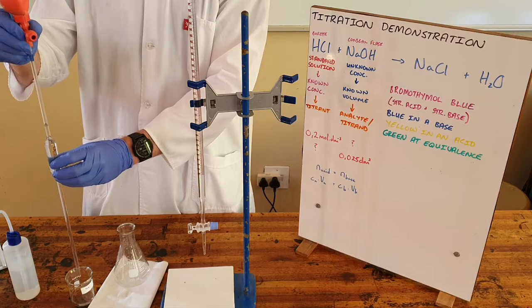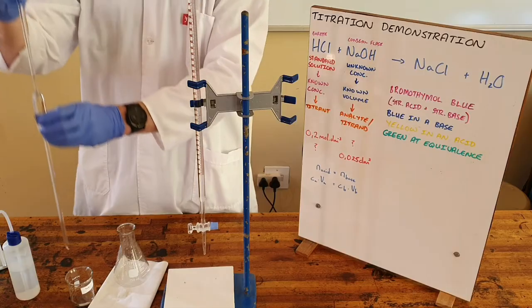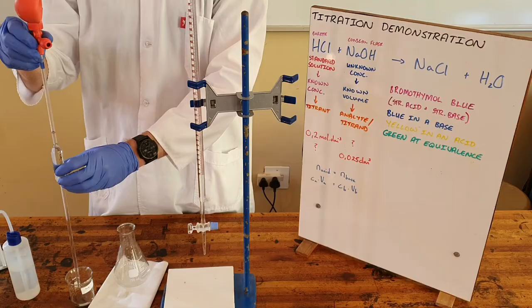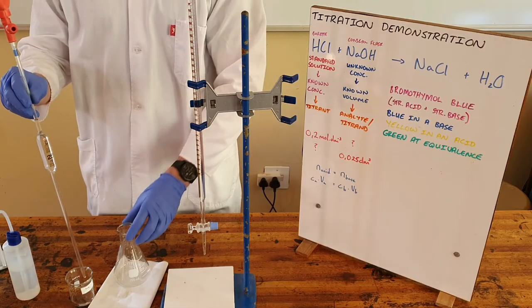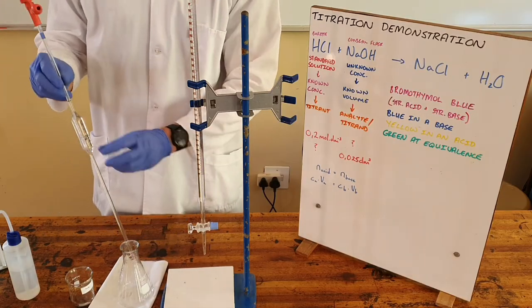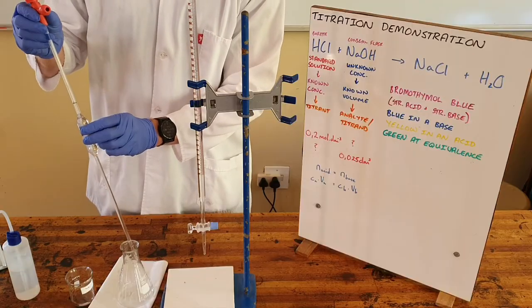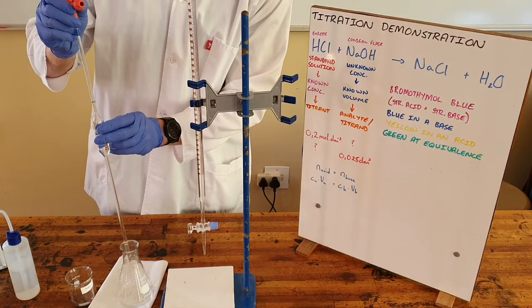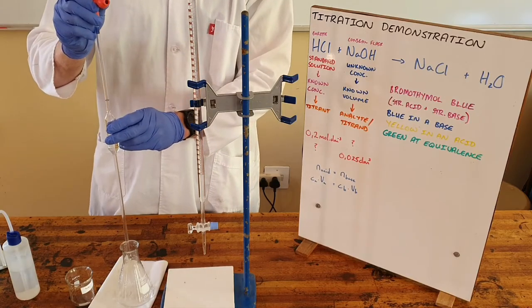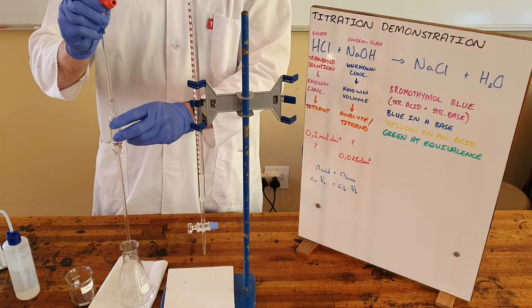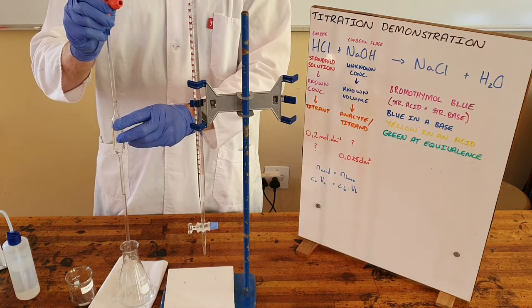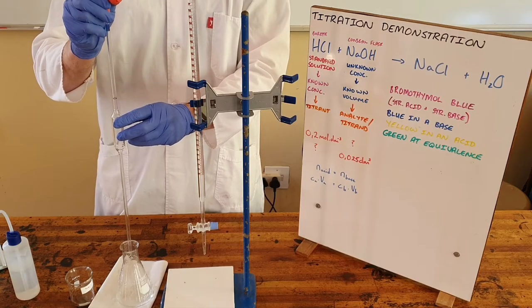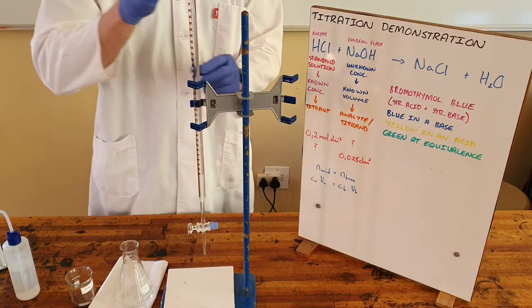We also ensure that it is the bottom of the meniscus that aligns with that mark. What we then do is we deposit this quantity of sodium hydroxide into a conical flask. The conical flask here does have some liquid present in it already and that is because it has been rinsed with water which is acceptable because the number of moles of sodium hydroxide does not change when we add it to water.